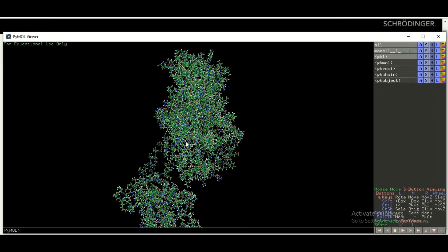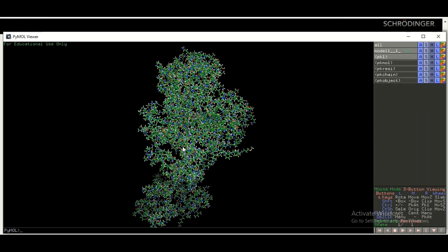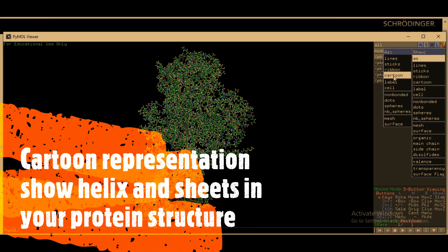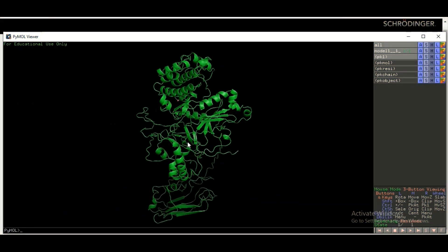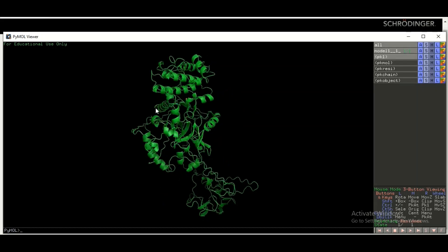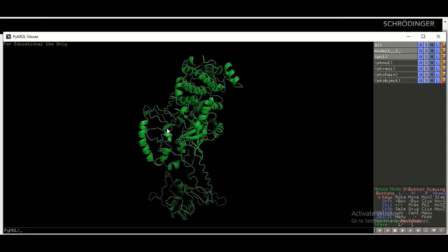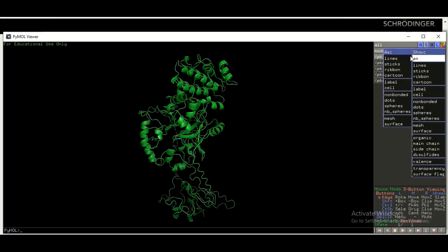If sticks is not your preferred representation and you want to visualize the alpha helices and beta sheets present in your protein structure, go to S, then Show, then click on Cartoon. The protein three-dimensional visualization will change, and now you can visualize the alpha helices, beta sheets, and loops present in your three-dimensional structure.